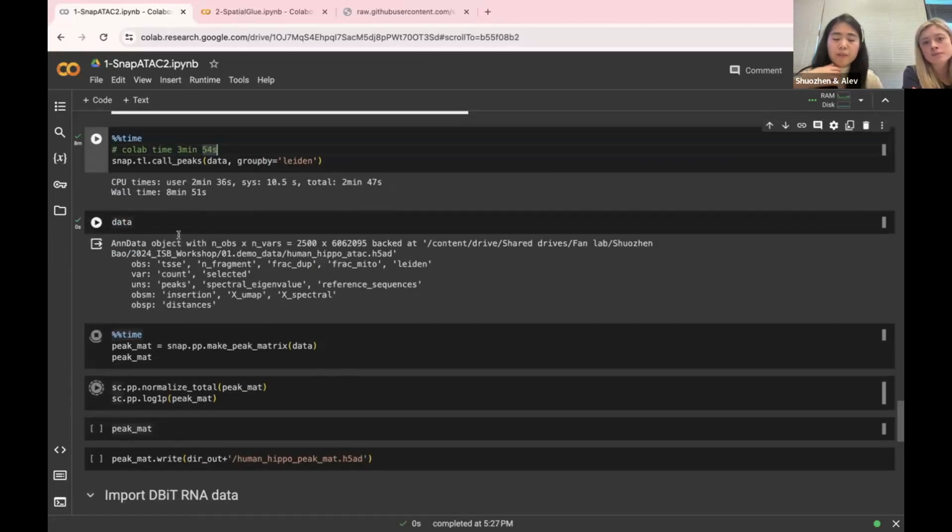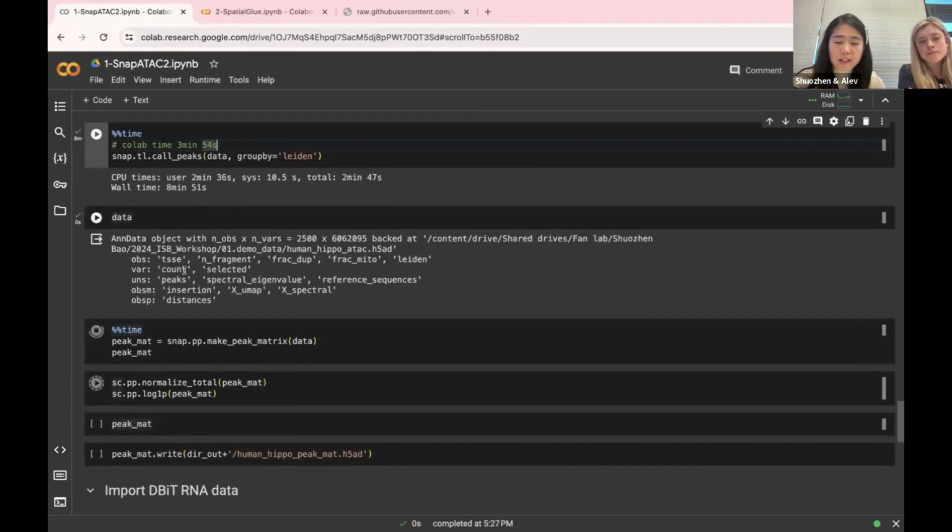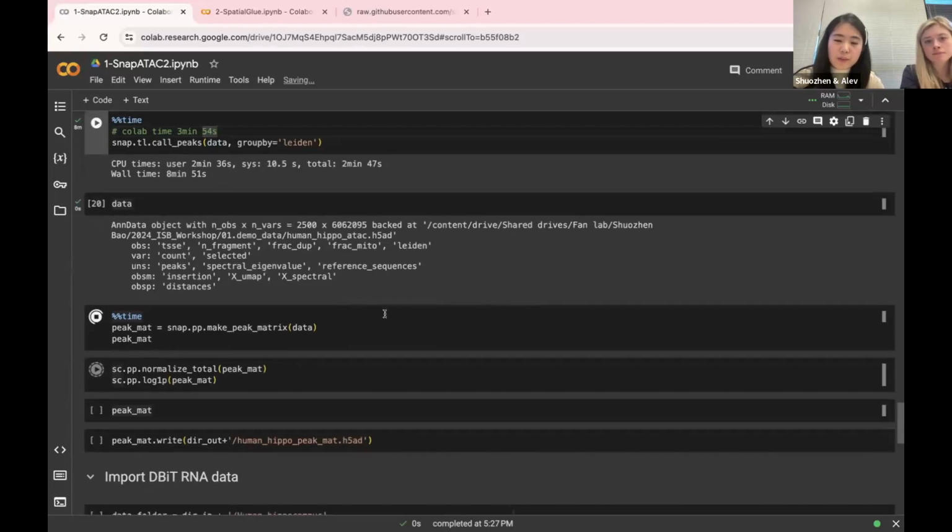Yes. So whether you're using an R data structure or a Python data structure, there's always a location where you can put your spatial information. And then with that added into your data structure, we can use those packages to map back the spatial information.